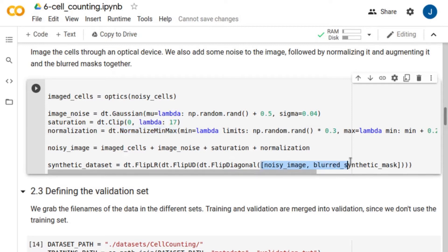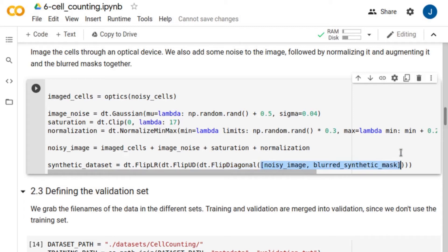Then, we combine the cell images and Gaussian labels into a single database, and apply some augmentation to the images, including left-right, up-down, and diagonal flipping.